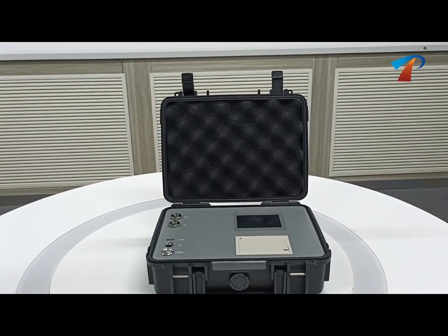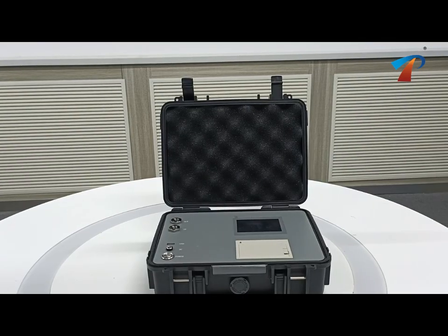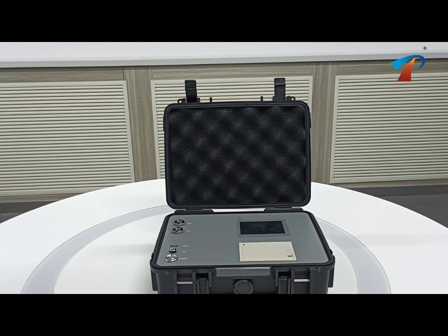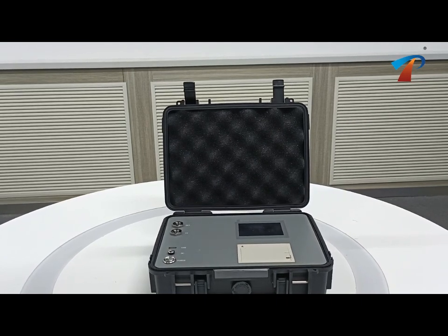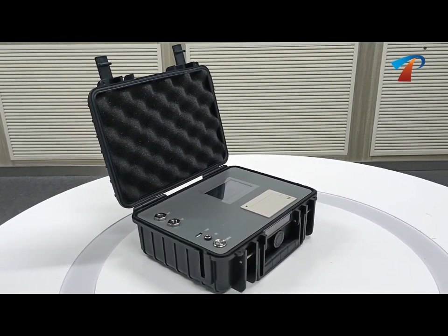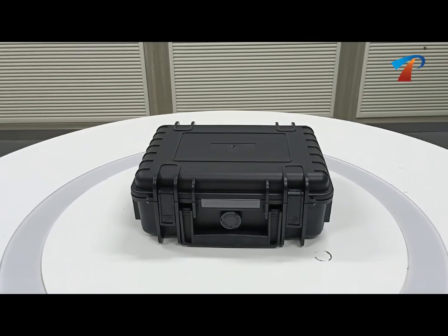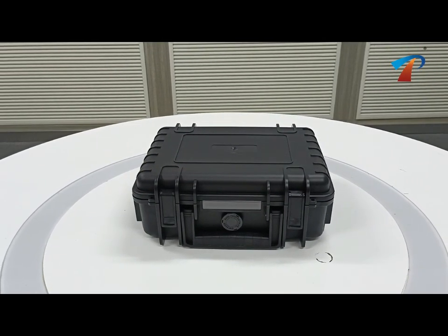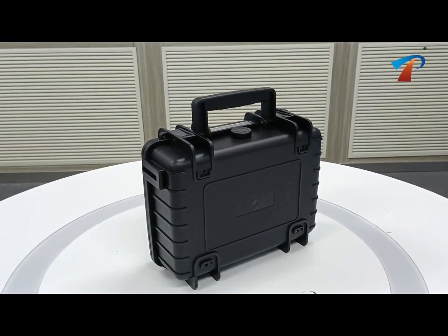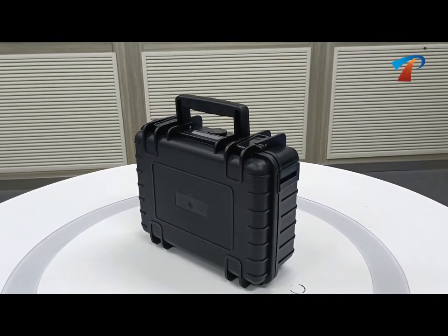1. After cleaning, it is necessary to empty and ensure that there is no liquid in the liquid inlet. 2. If the oil viscosity is relatively large, you can heat it up or choose a pressure sampling device to test. 3. Bubbles in the test process will be identified as large particles, resulting in inaccurate test data. 4. Before the test, clean the pipeline with petroleum ether and then conduct the oil test. 5. The filter needs to be cleaned every 6 months.